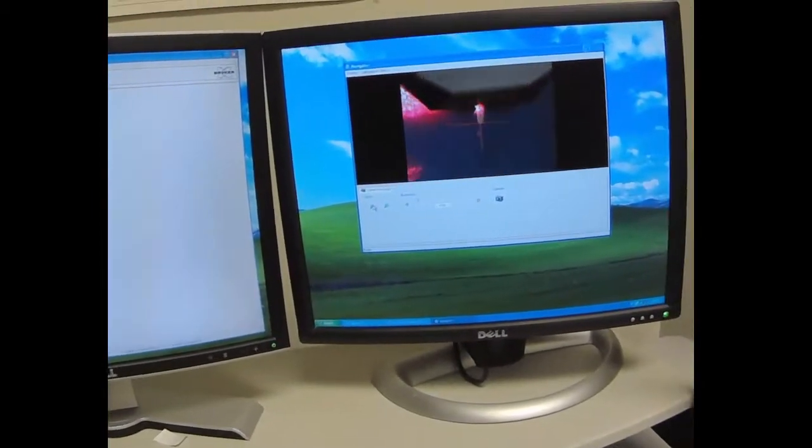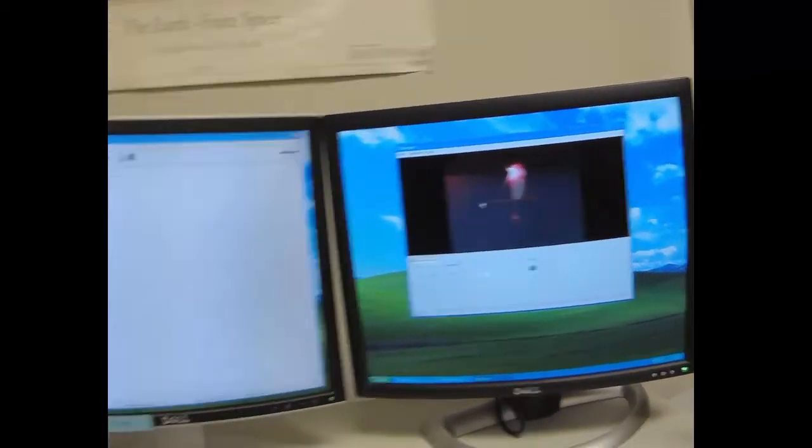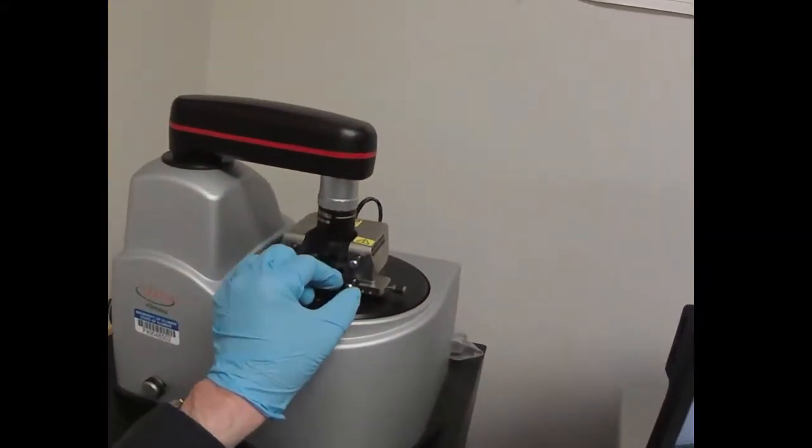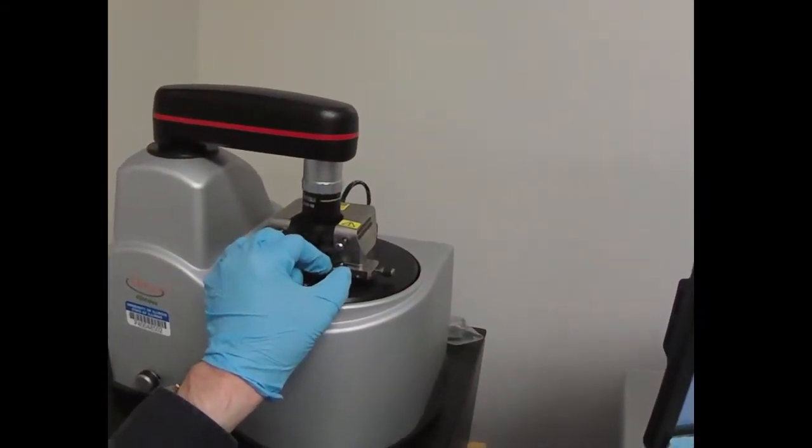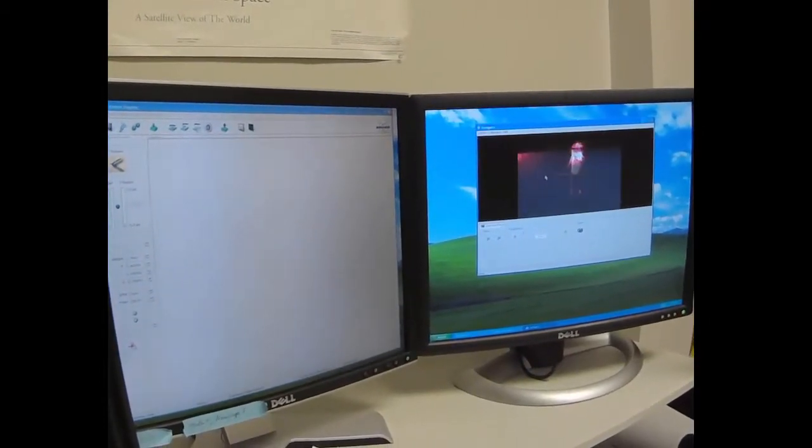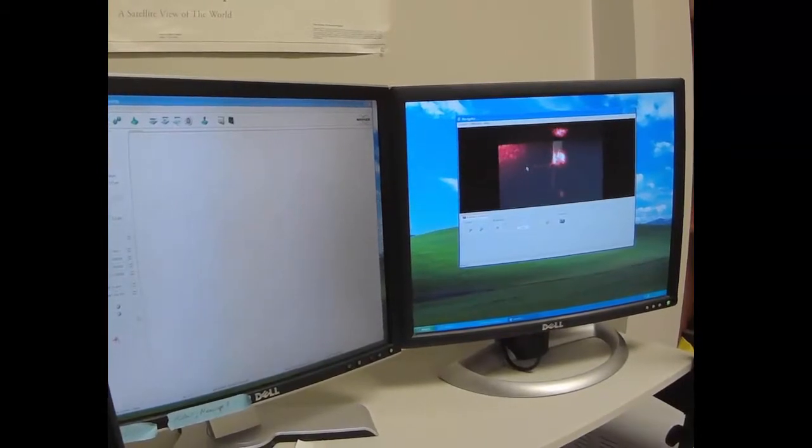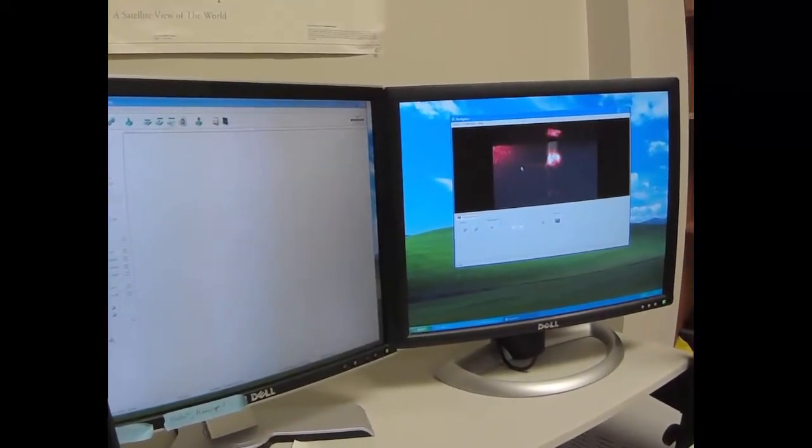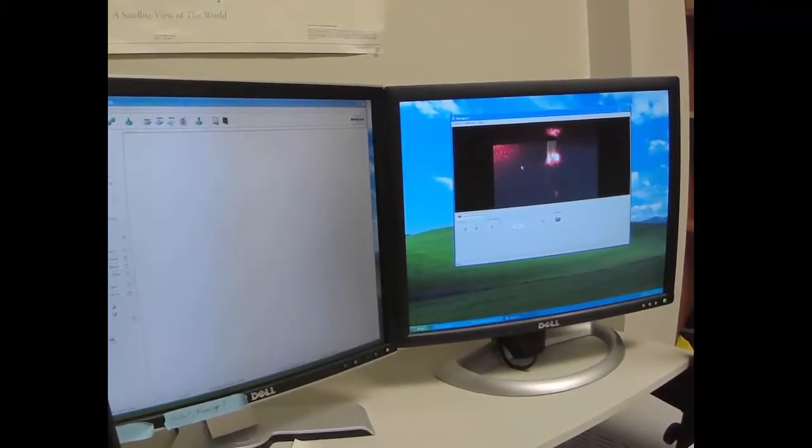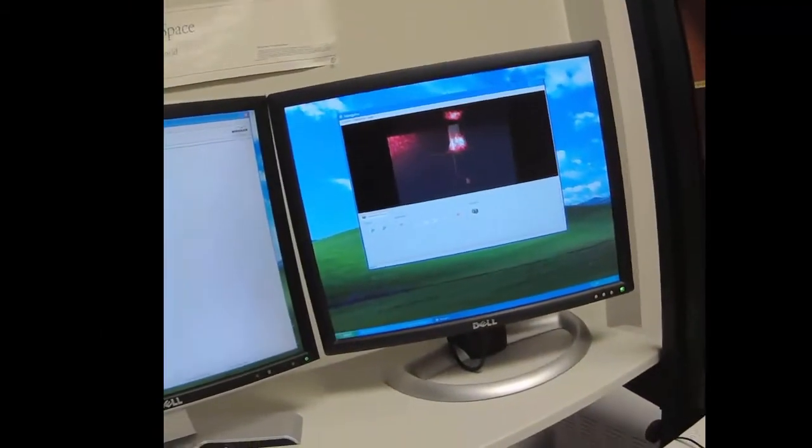So when I zoom in, I'll definitely still be seeing the cantilever. And I want to get back to my laser alignment, move these mirror knobs slowly to get the laser spot toward the end of the cantilever and balance. That's about perfectly centered where I want that laser spot to be.